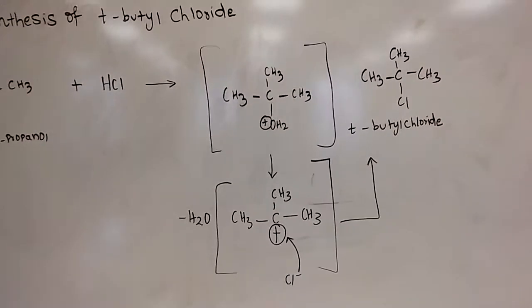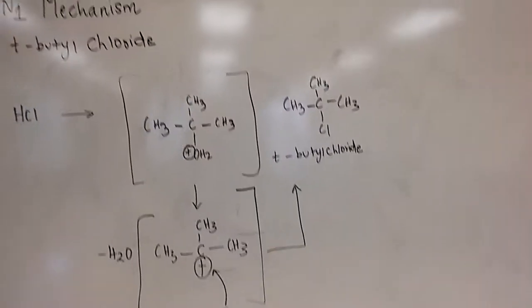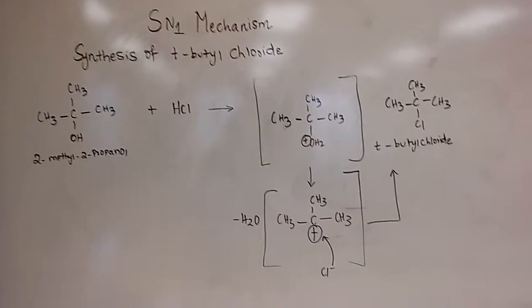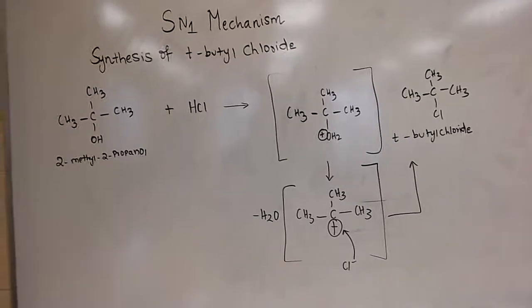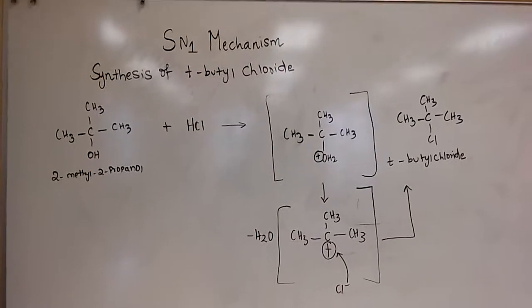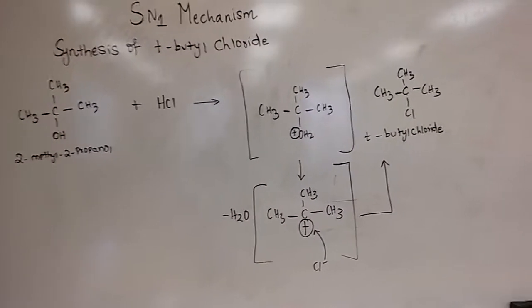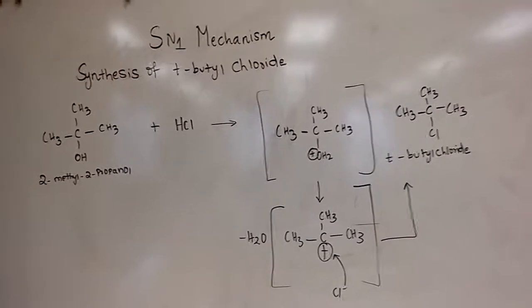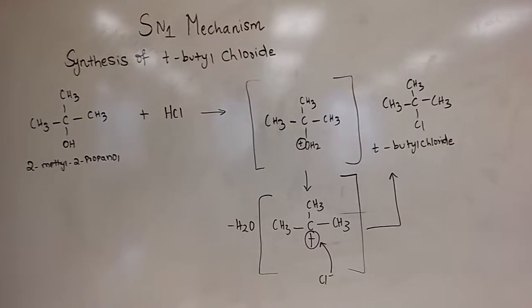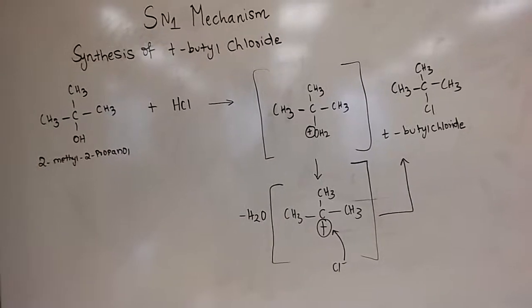And then you can see the nucleophile Cl- attacking the carbon containing the positive charge, and it leads you to the formation of t-butyl chloride. So for just the synthesis part, we only need 2 chemicals. We will use additional chemicals as we extract, dry, and purify the product. We use a couple of standard chemicals, but it's a pretty simple lab, not requiring 100 different ingredients going at 100 different times.